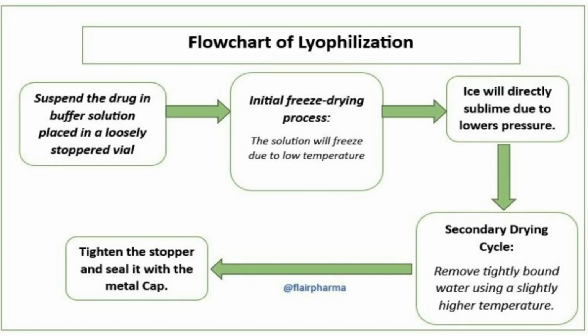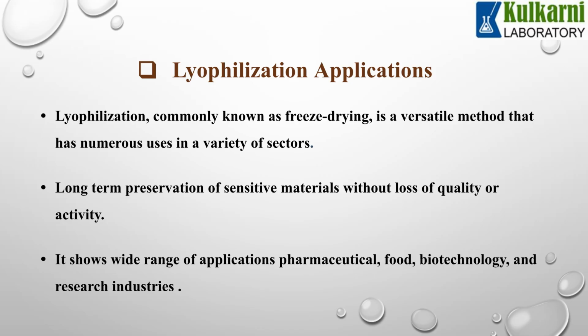The flow chart of lyophilization shows the process starting with suspending the drug in a buffer solution and freezing it. The initial freeze-drying step causes sublimation. This is followed by secondary drying and then sealing the final product.